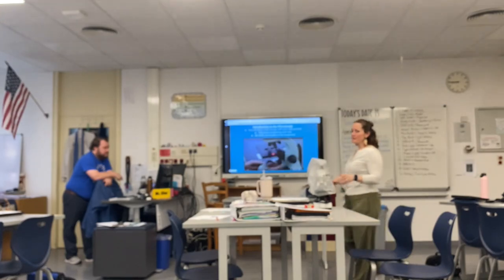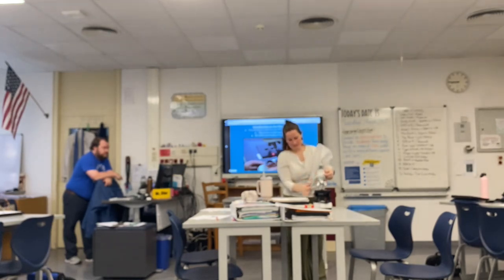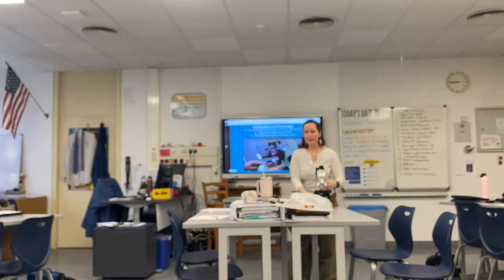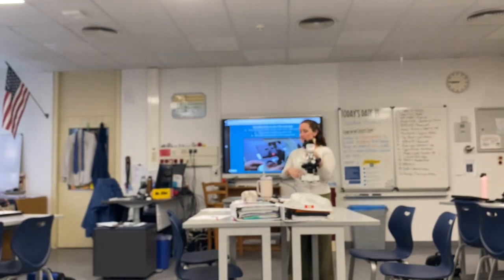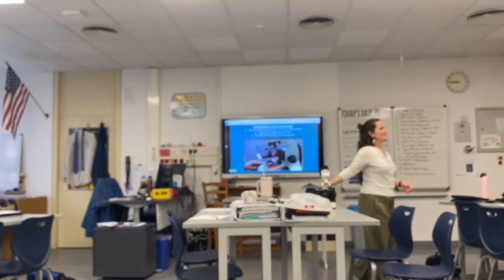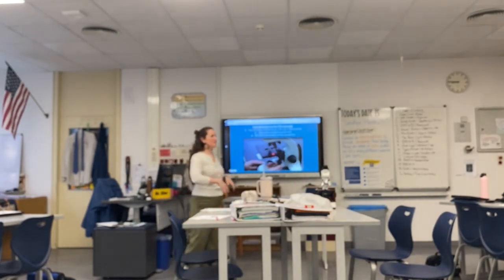Okay, what I'd like everybody to do is take the cover off your microscope and find the closest power outlet. Gently unwrap your power cord and plug in your microscope. Turn it on. Your switch is right here on the top of the base. Let me make sure everybody is able to turn theirs on. Okay, does everybody have light? Yep, we have light.